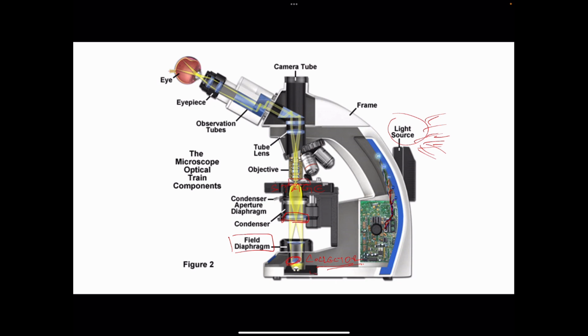Now, if you see it carefully, an objective lens is not a single lens. It's a turret like this, which has basically multiple lenses here, which I'm marking in red. Now, a collection of all these different lenses itself forms the objective lens. And we have objective lens associated with different magnifications such as 100x, such as 60x, 20x, and whatnot.